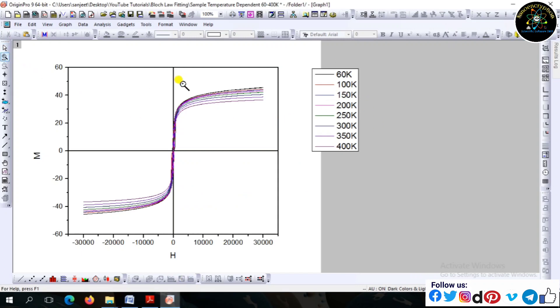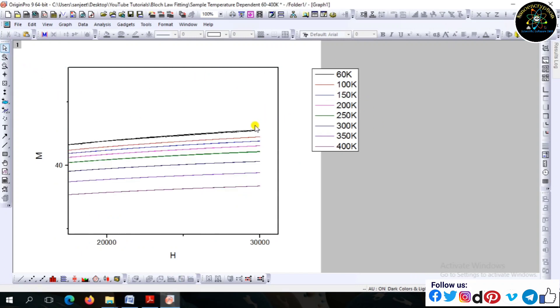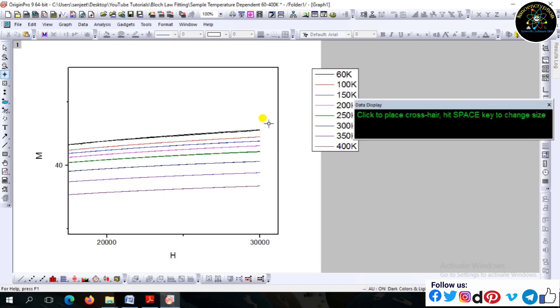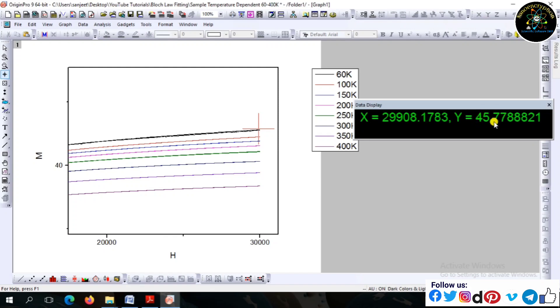Now zoom in to get the Ms value, or saturation magnetization value, from the MH loops. This is the saturation magnetization value.